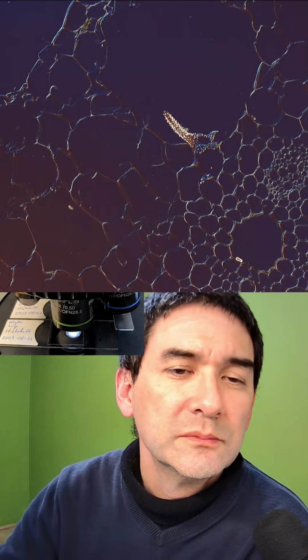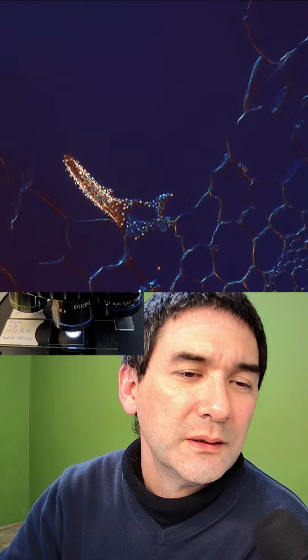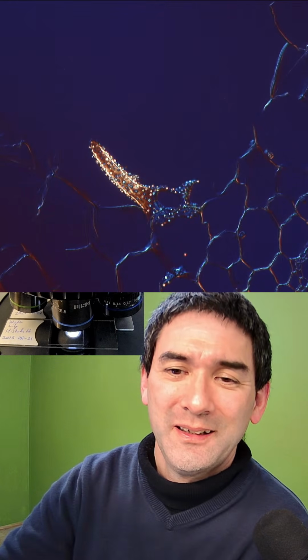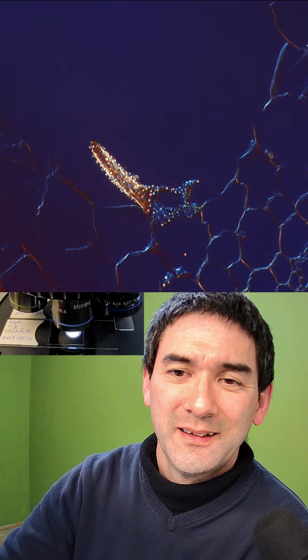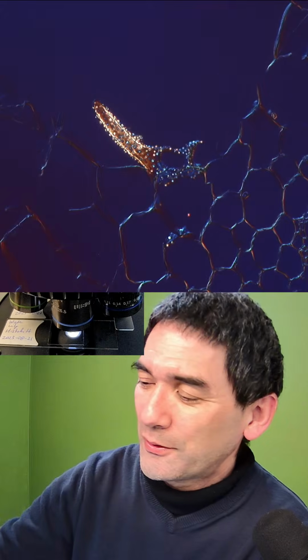Right in the middle. Yep, here we go. Yeah, they really start to shine. Let me see, can I go up yet further? Yeah, this is kind of nice.